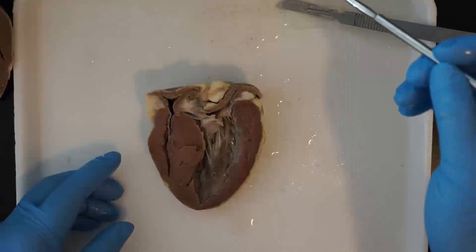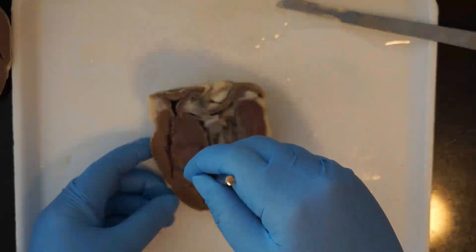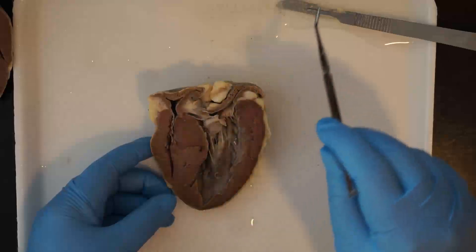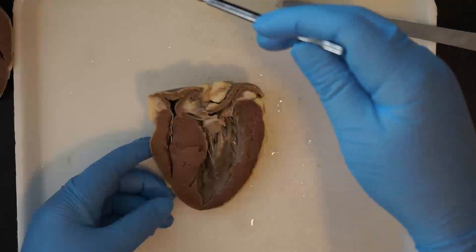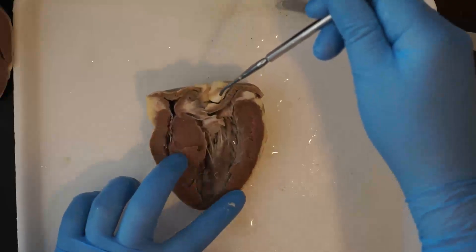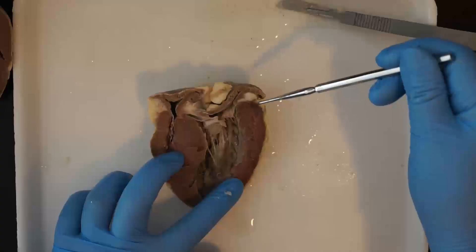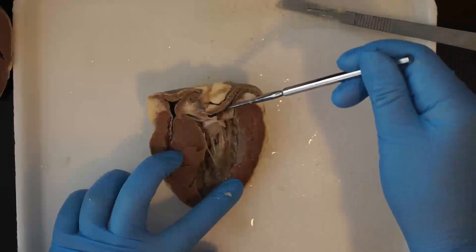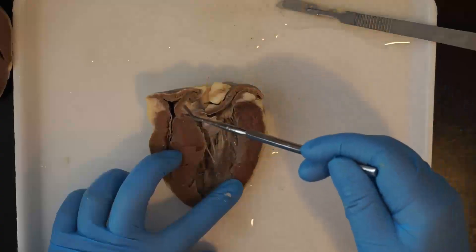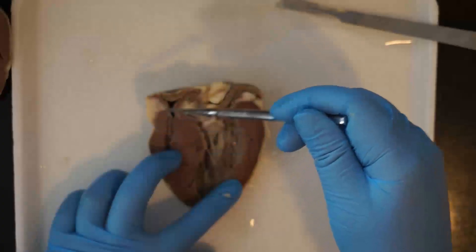Reviewing that blood flow again: blood comes in from the body tissues into the right atrium and the right ventricle, then out through the pulmonary artery to the lungs to pick up more oxygen, then back through the pulmonary veins into the left atrium, then down into the left ventricle, and then out through the aorta to the rest of the body again to drop off the oxygen, and then the cycle repeats itself.